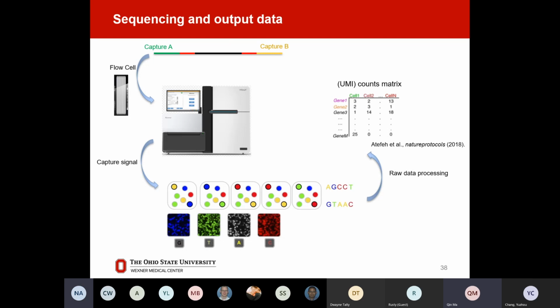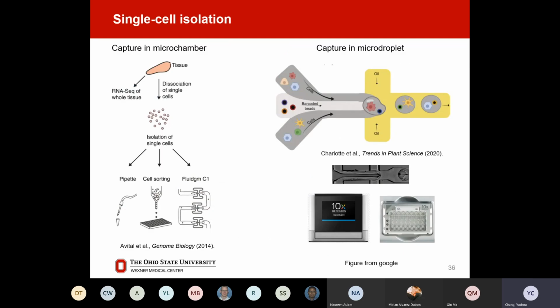We have a question from Miriam. Sure. Hello, I sort of agree with Dr. Gonzer regarding the error rates. Is there a high error rate from the barcode itself, since it's random, being on different RNA-Seq? You mean the barcode for the droplet strategy? Yes, correct. Okay, you ask a very advanced question.